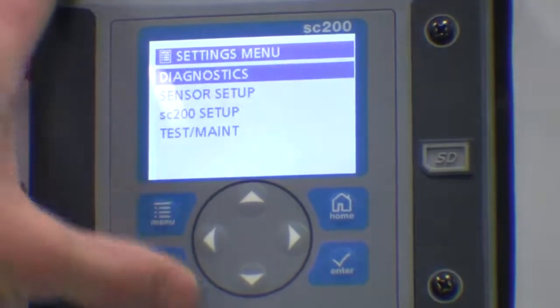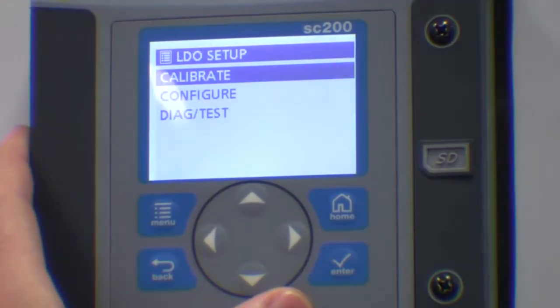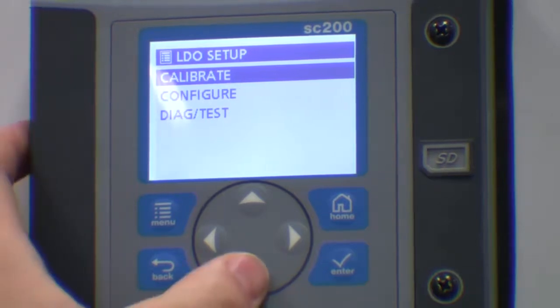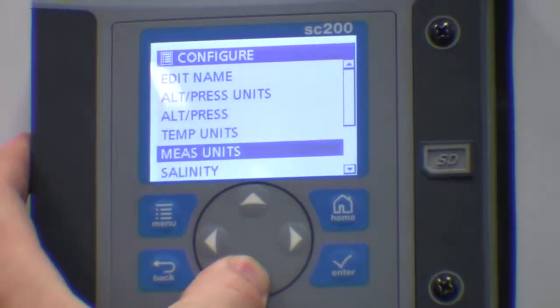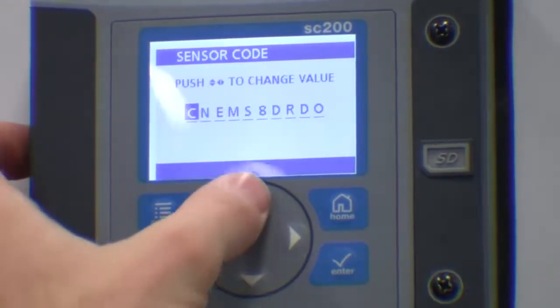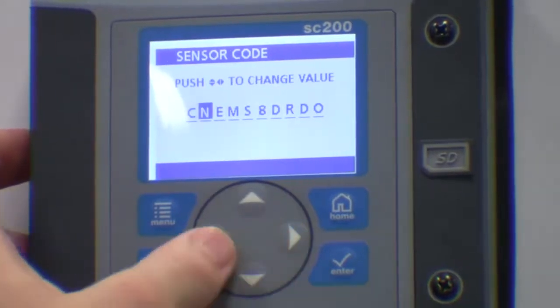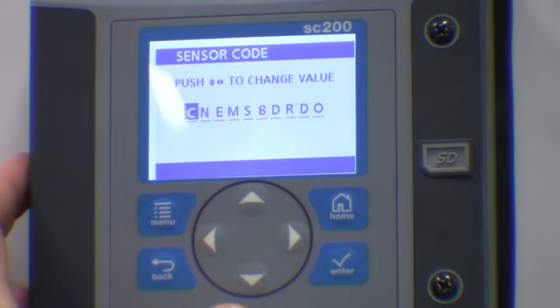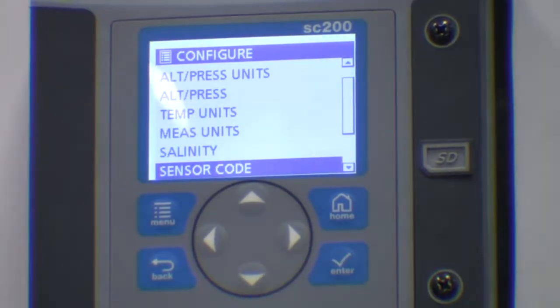Select the menu button and then select sensor setup. At this point, if you have more than one sensor connected, you would have needed to select the correct sensor. Now select configuration and then carry down through the menu until you find sensor code. Use the up and down arrows to change the character and the left and right arrows to select which character you wish to change. Once you have edited all the characters, press the enter key. Your probe is now ready for operation.